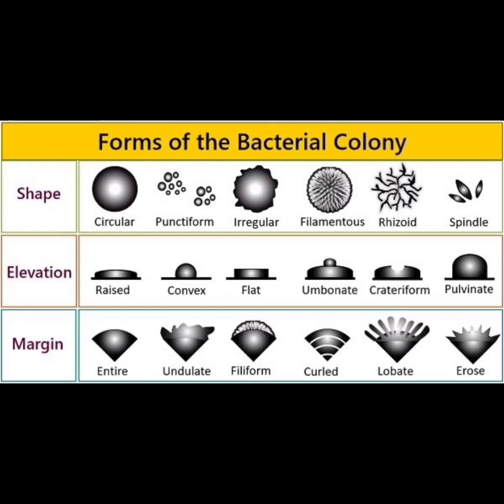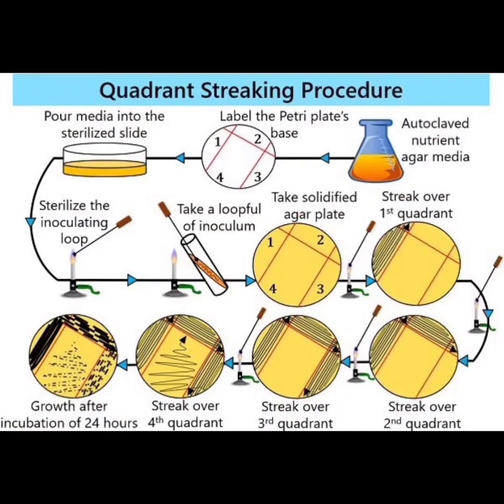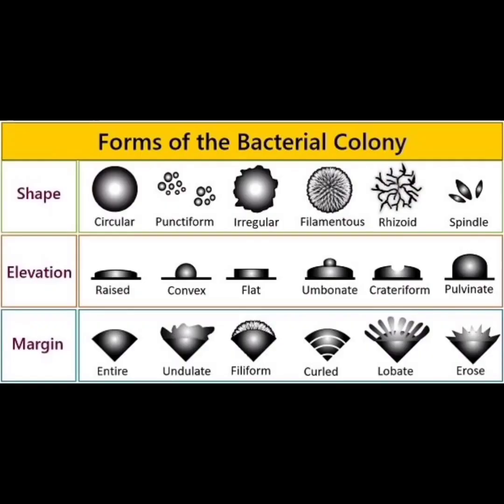The other thing we want to know is how to streak on a medium. That is a simple thought, and we can just talk along with this. I will teach you about that. The identification process of an unknown microbe relies on obtaining a pure culture of that organism. That is the identification process.